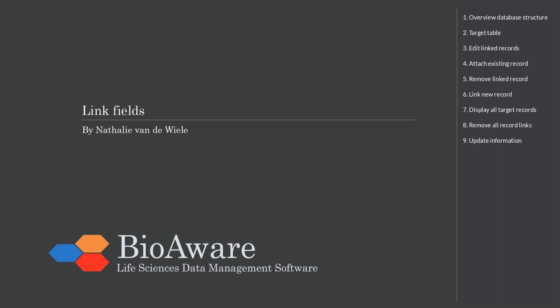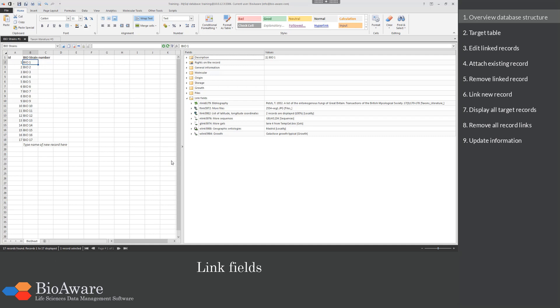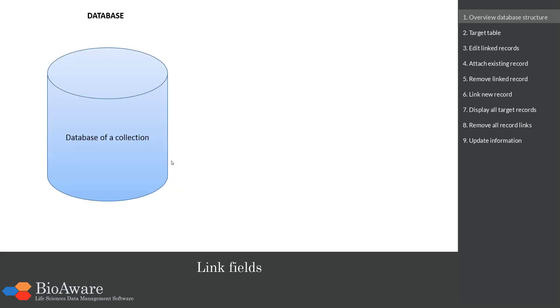Hello and welcome everyone. My name is Nathalie van der Wielen and in this movie we will show you how to manage link fields in Biolomics. Link fields are created to connect two records with each other. To explain the linking, I would first like to give you an overview of the structure of the database.